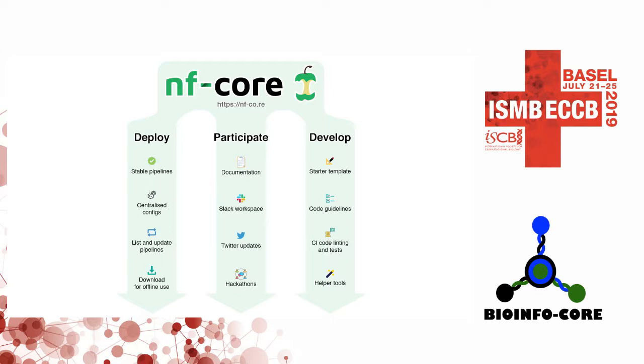We're also trying to work on, so this is at the pipeline level at the moment, we're also trying to work on having an overview. So if you imagine a lot of core facilities, they have a high throughput of data, different types of data. So it'd be nice to, providing that you have the right metadata, which is actually key, you can imagine the data coming off the sequencer, getting relevant information from a LIMS system or something like that, and then just automatically pushing the pipeline through to be analyzed. So we're looking at ways, hopefully, to try and monitor all of that as well. So you can submit multiple pipelines and see how they progress, whether it's failed, whether it's passed, and so on.